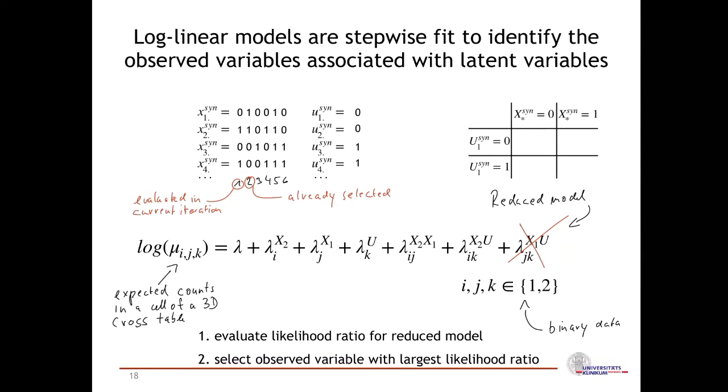And so we would now like to do this with our single-cell RNA-seq data. Since R has a rich toolbox for all kinds of omics data analysis, like annotation and processing data, and also gives access to all other statistical approaches, R is a really good platform for this.